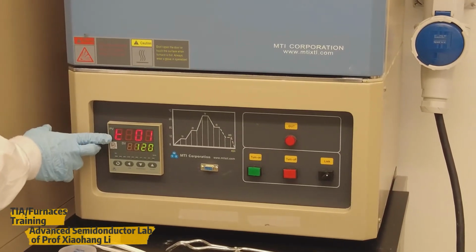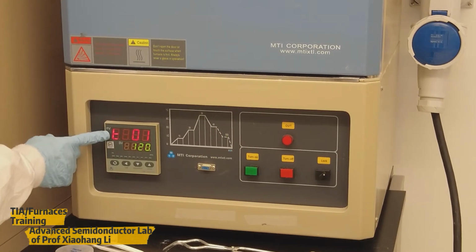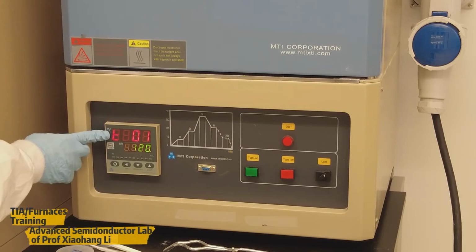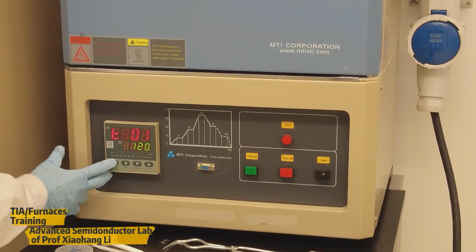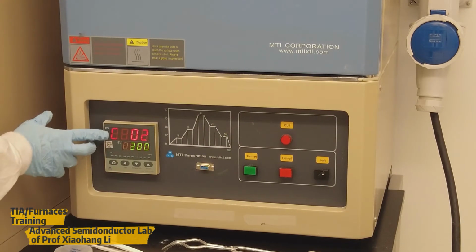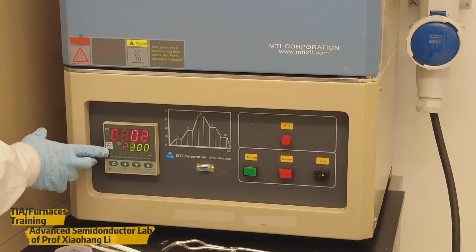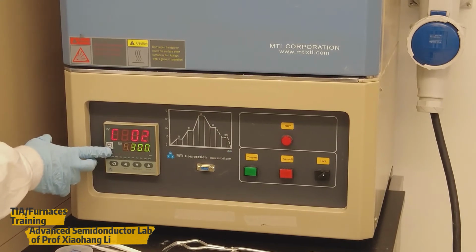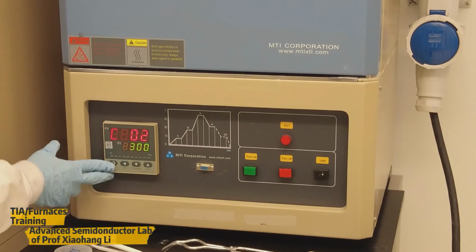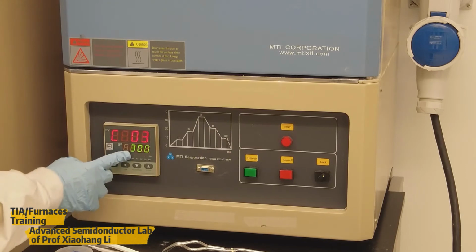Right now, we are setting T01. This is how long we're gonna use to increase the temperature. Our setting right now is 120. Then to go to the next settings, C2, 300. This one is from the previous C1 setting, 20 degrees C room temperature, with 120 minutes raised to 300 degrees C. Then we want to keep 300 for 100 minutes.